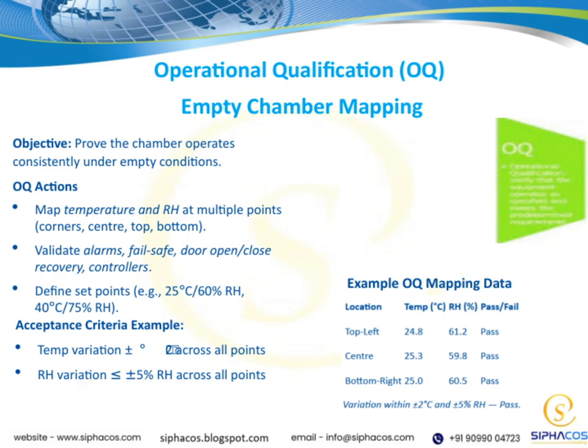We also need to validate that alarms are functioning correctly, that fail-safe mechanisms kick in when needed, and that the door open-close recovery processes work smoothly. Plus, ensuring that controllers respond as expected is crucial.